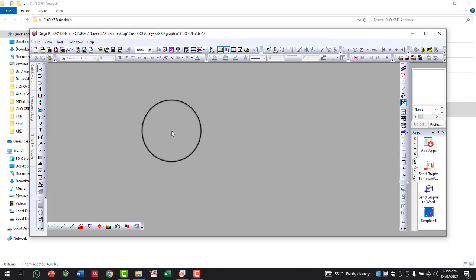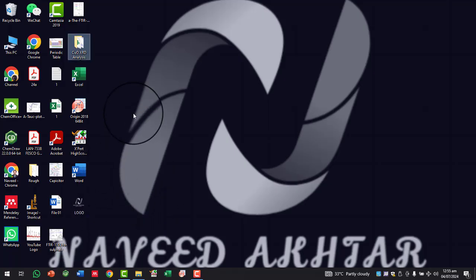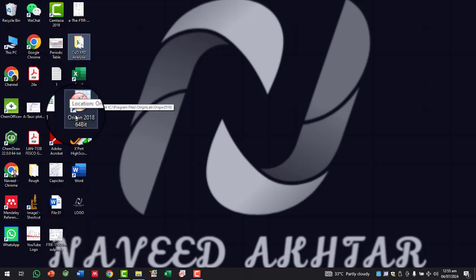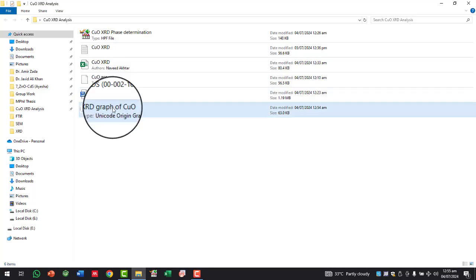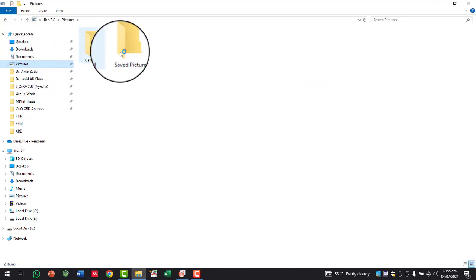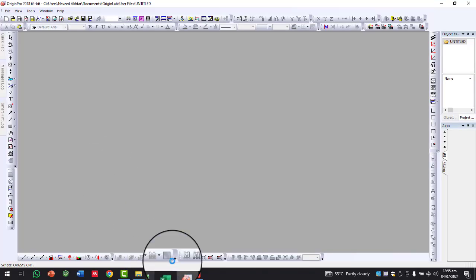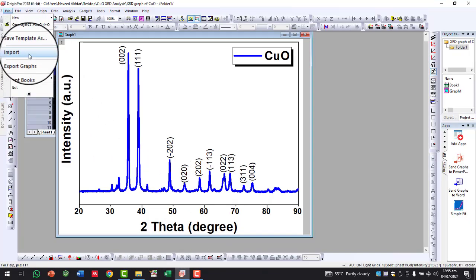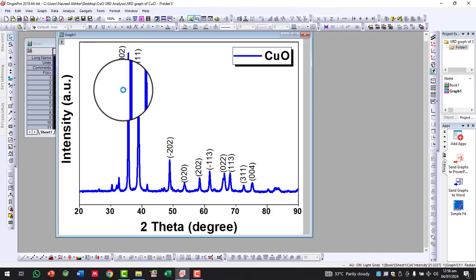Sorry, this is the Origin file. I have to save the graph again in the picture format.